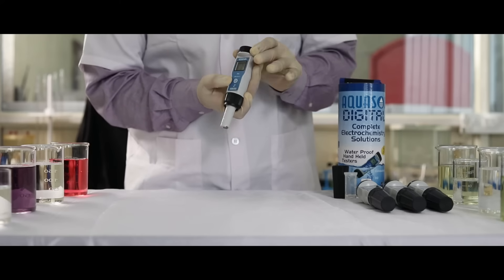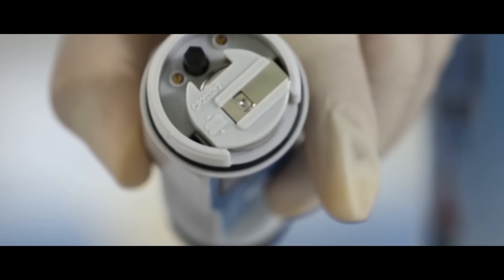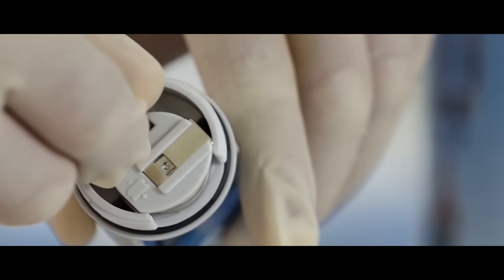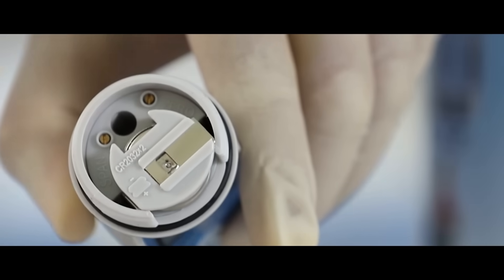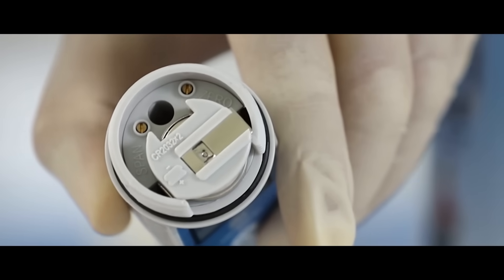To calibrate, remove the battery cap. For calibration, there is a screwdriver provided. For pH7, use the zero screw to adjust, and for pH4 and pH10, use the span screw.